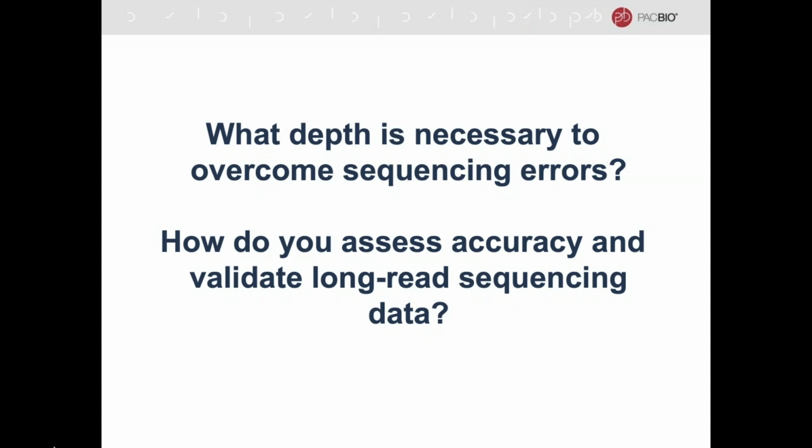It's very interesting to see, a little bit scary when I think about all the PCR work I've done in the past. And I think that validating that data, you validate in any way you validate any sequencing data. An orthogonal method, if you really want to qualify that variant that you're interested in, is the way to go.